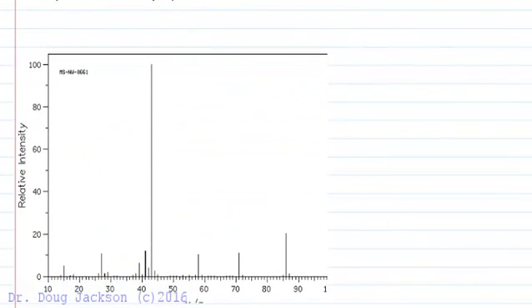So here's a spectrum and we're going to label the molecular ion as the highest non-isotopic peak. I don't see any evidence of chlorine, I don't see any evidence of bromine for the M and M plus 2. Let's look and see what this is. This is 86. Very small carbon-13 isotope peak here that we can ignore.